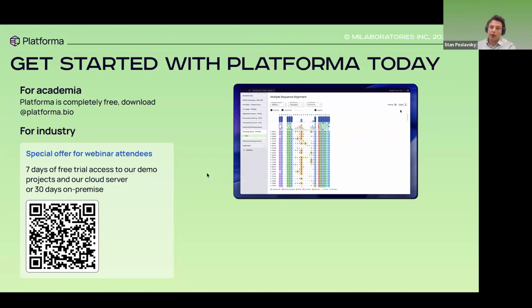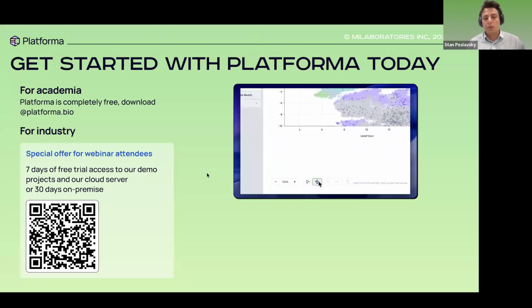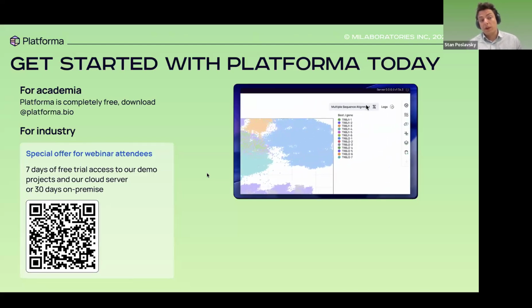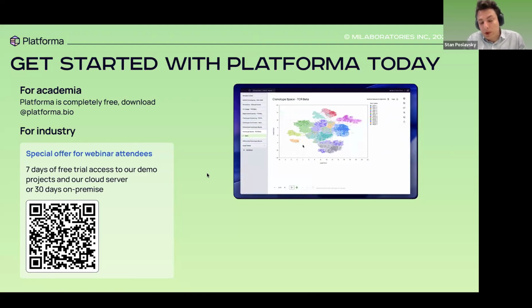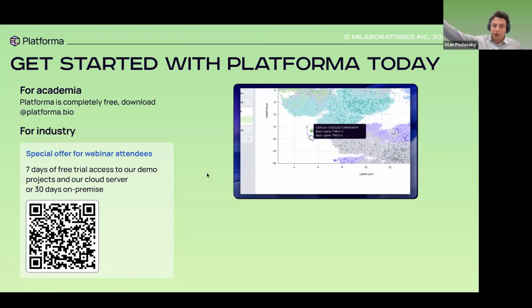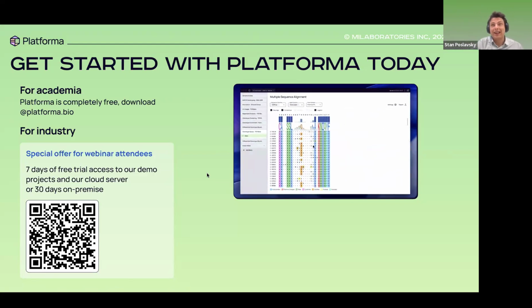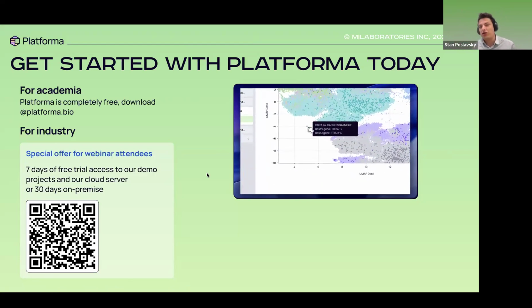That's why we use in vivo. We rely on the natural immune system: the more mutations, the more mature the sequence, the higher the affinity is. That's our proxy. For the functional validation, for the ELISA data, we of course do them with ELISA, and specifically in this example, we can map the results of our wet lab testing back on the NGS data set, and this closes the loop, and we can further guide our selection from the NGS using this wet lab validation.